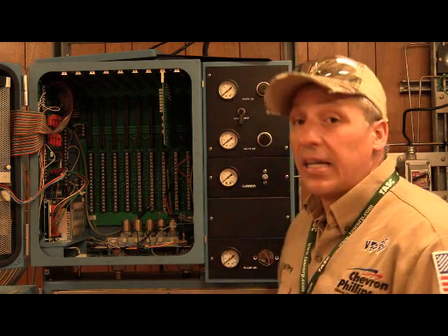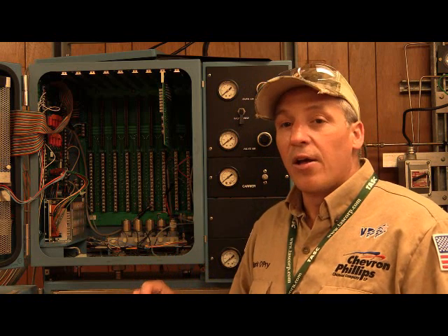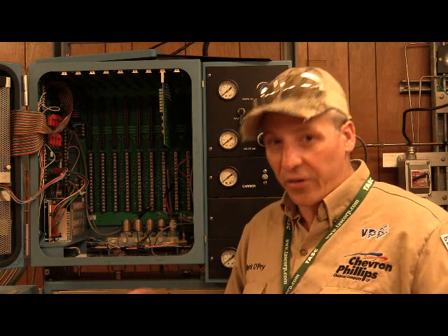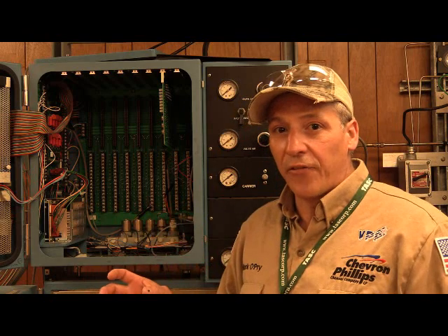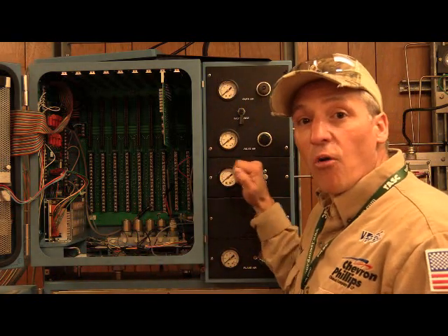We're going to have an oven. This oven is going to get to a temperature of typically 140 degrees Fahrenheit. What is that in Celsius? 60. Those are two numbers you need to know for the rest of your life if you're going to do gas chromatography. 60 degrees Celsius is 140F. When we talk about chillers and stuff like that for sims, 4 degrees is 40. Okay. So, back to carrier regulator.